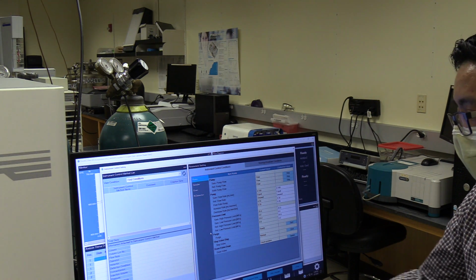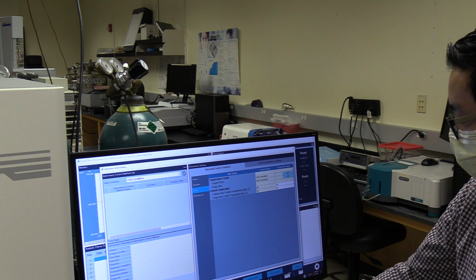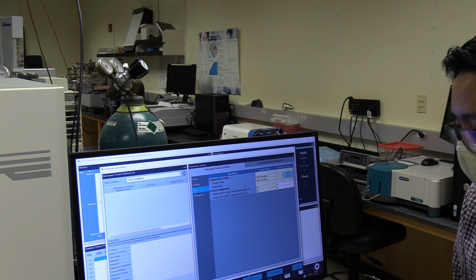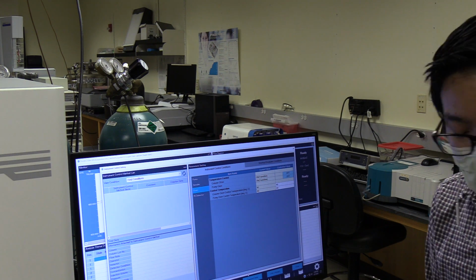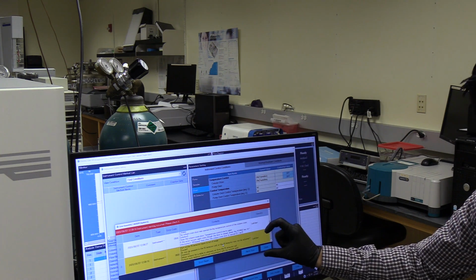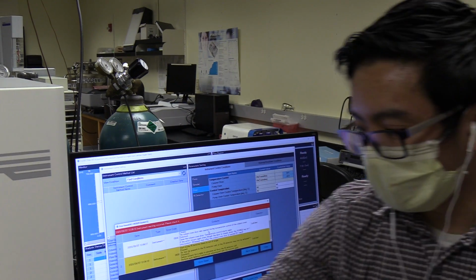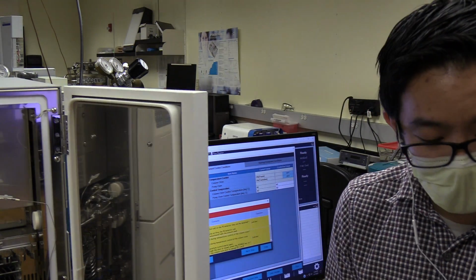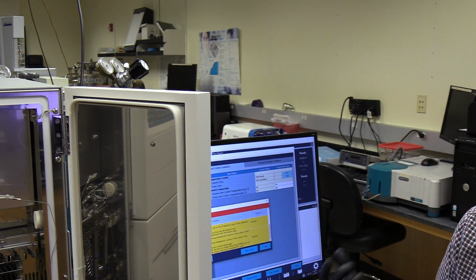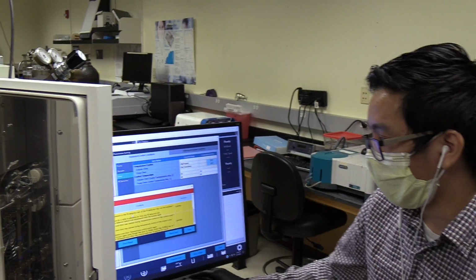If we were doing sample analysis as well, I would also go to my oven and turn on both ovens to make sure those are both on. In the event that you are running two columns for your analysis, this is an error to showcase that something's going wrong. This will often happen when you open the column oven when the column oven is supposed to be on. Since the column oven is supposed to be on right now and it's set at 40 degrees, when somebody opens the column oven door, you'll frequently see an error come up.